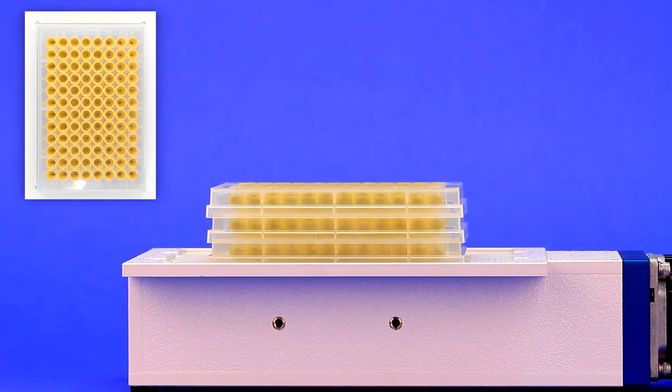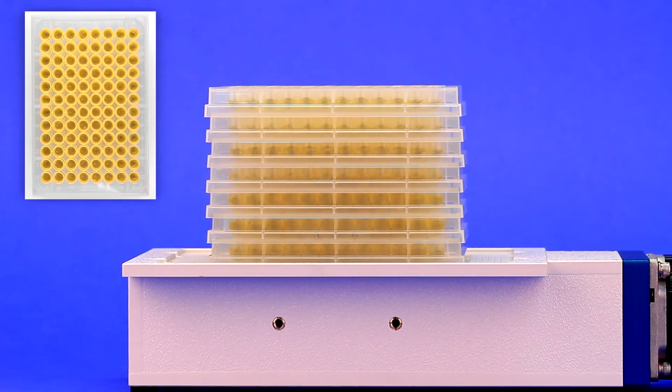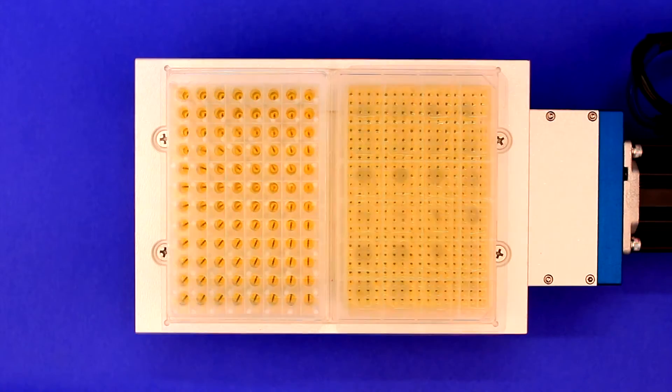Microplates can also be stacked to maximize your stirring capabilities. You can stack them up to seven microplates high. Plates can also be positioned side-by-side for more access.